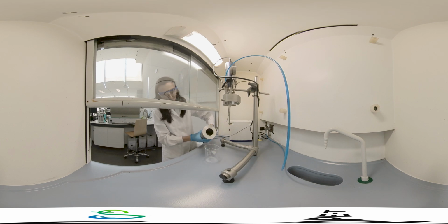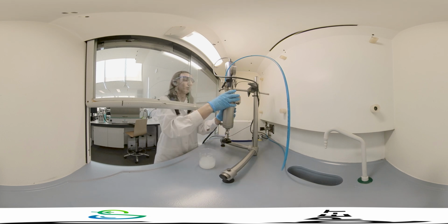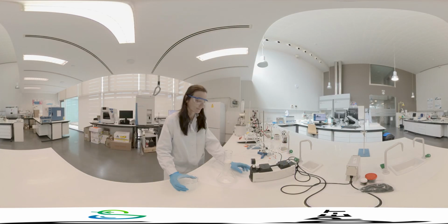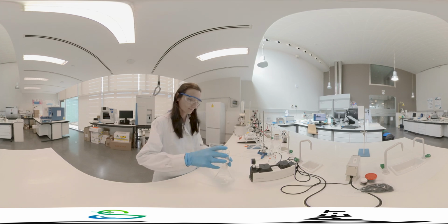This reaction is performed under mild conditions, and after a specific time, a white solid appears. The amount of precipitate increases quickly. The resulting polyethylene glycol is characterized by size exclusion chromatography to confirm its purity and molecular weight.